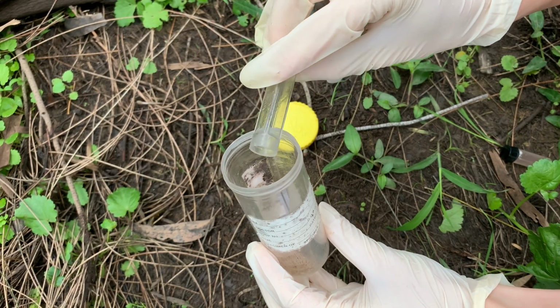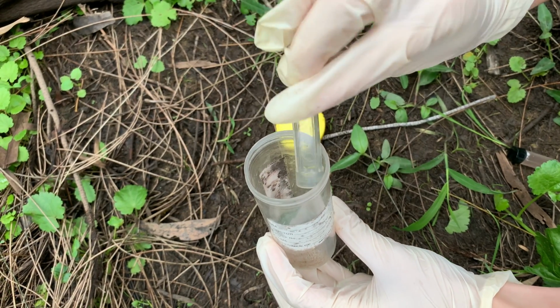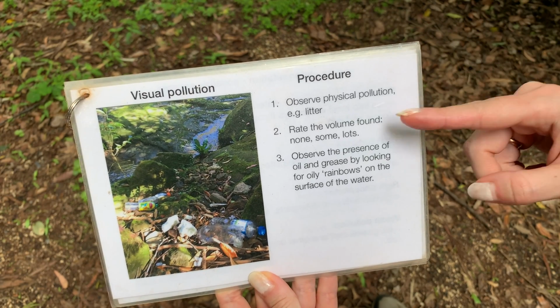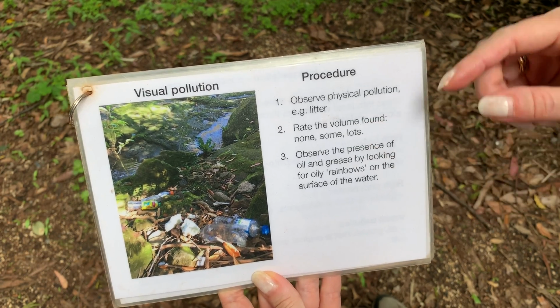And we always make sure we safely dispose of our waste. Another test that's good to conduct is how much visual pollution you can observe in the creek.